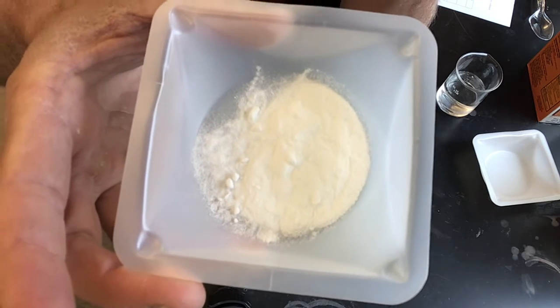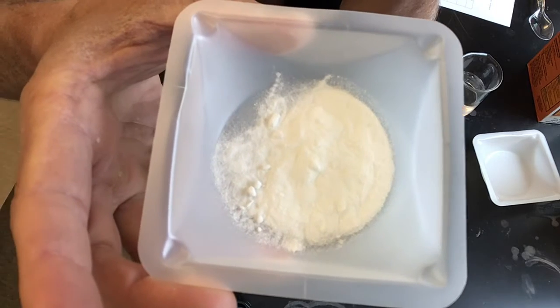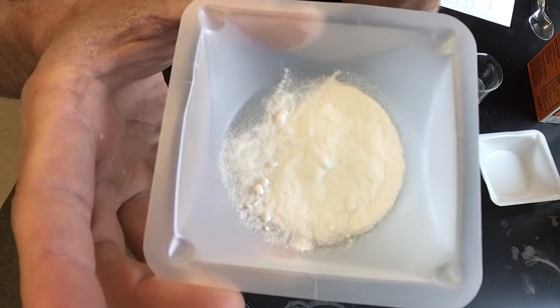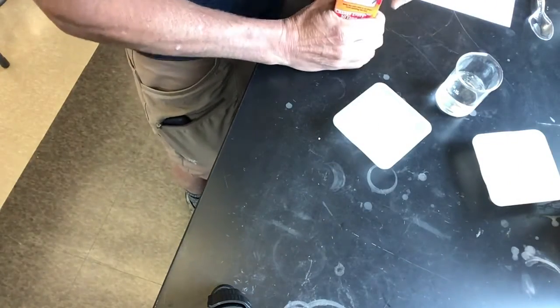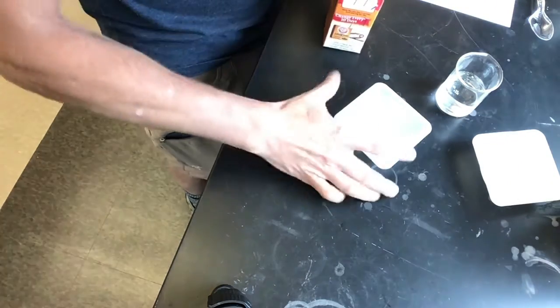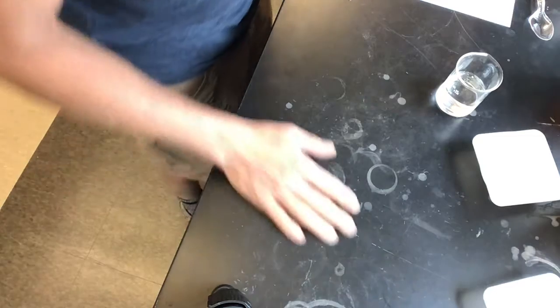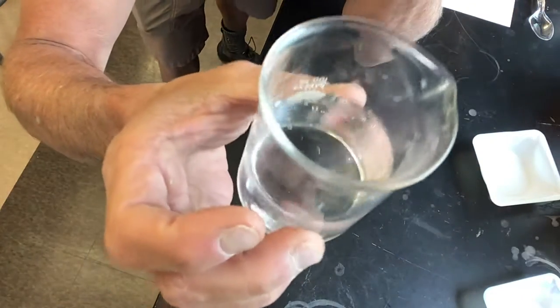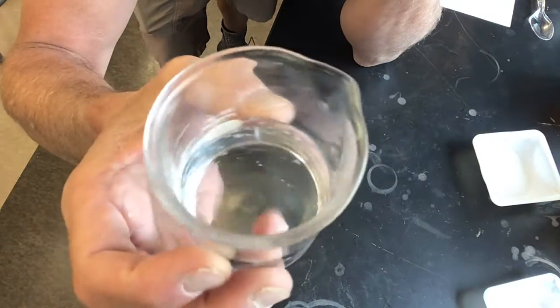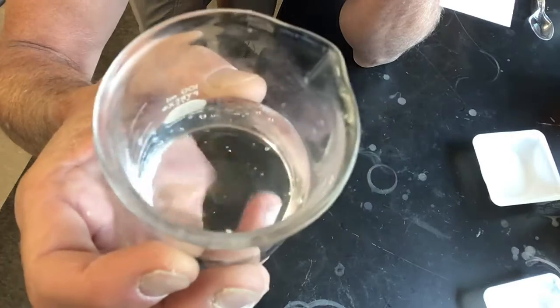Go ahead and make your observations in the second column of Table 1. The third is water. There are lots of different adjectives to describe the water. Transparent, liquid.